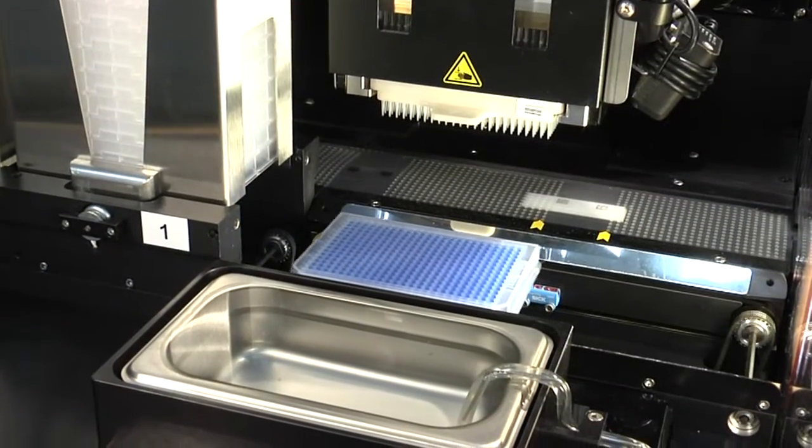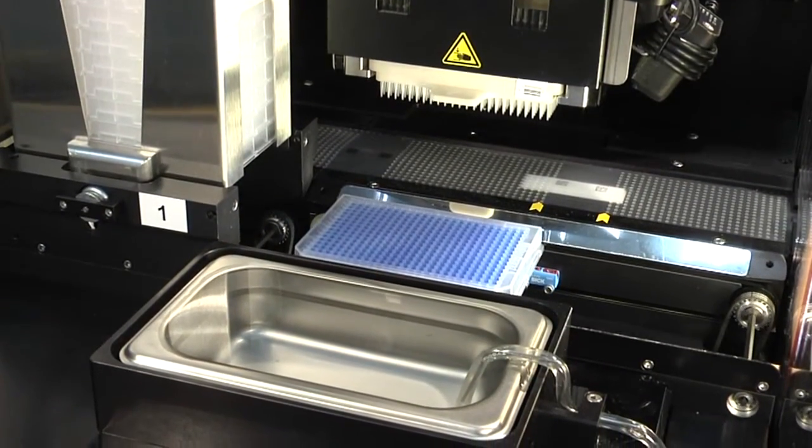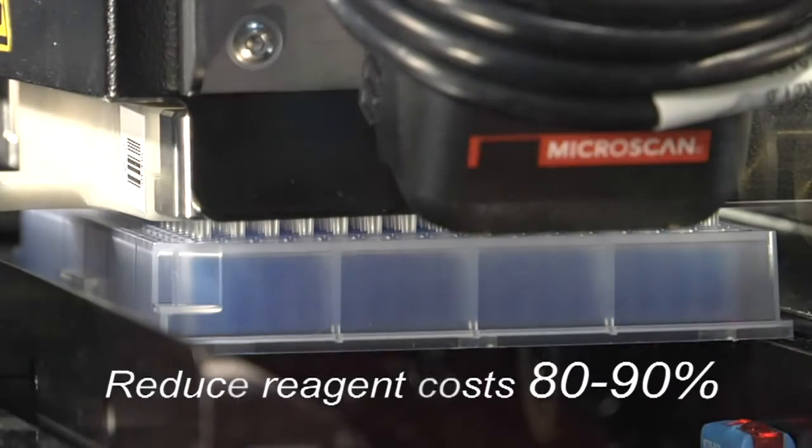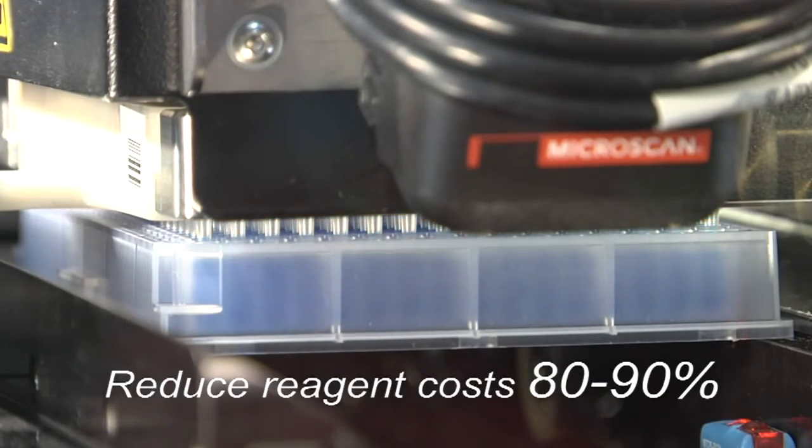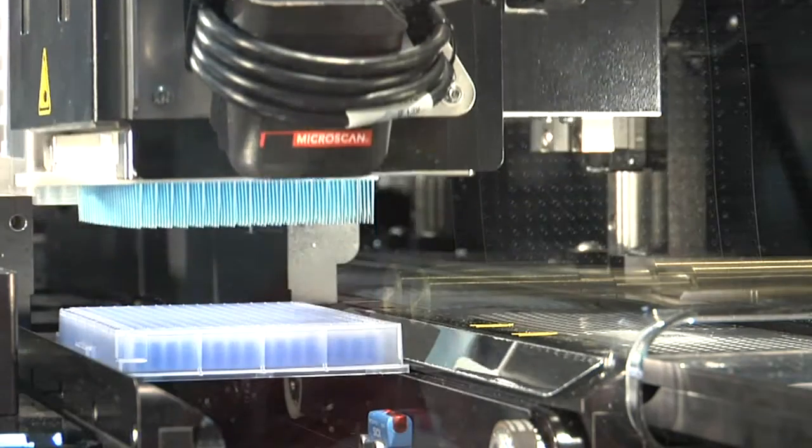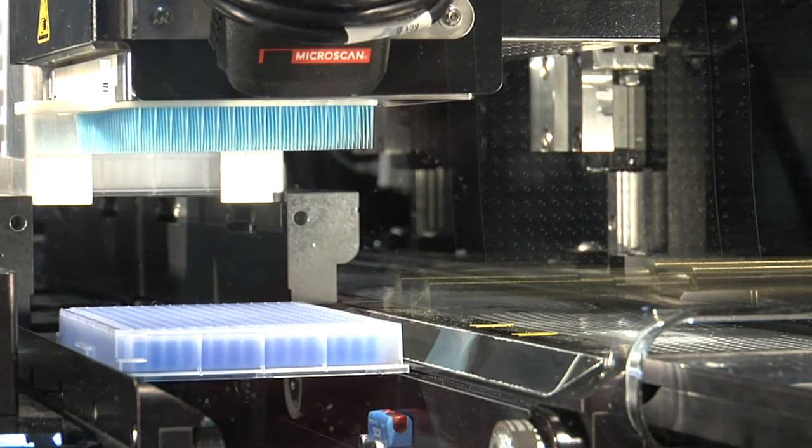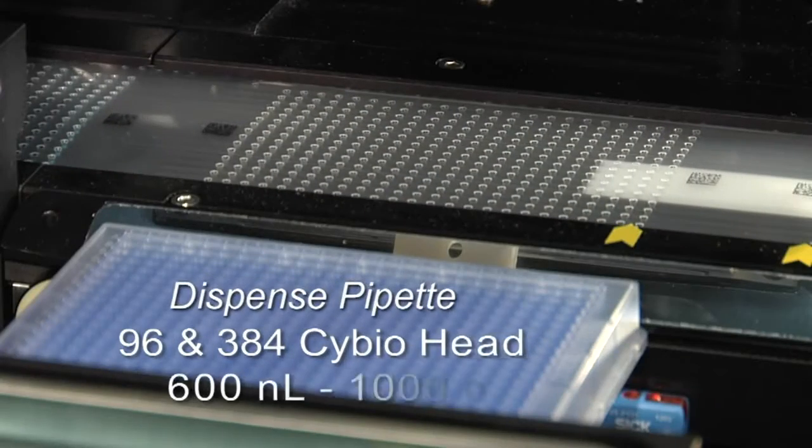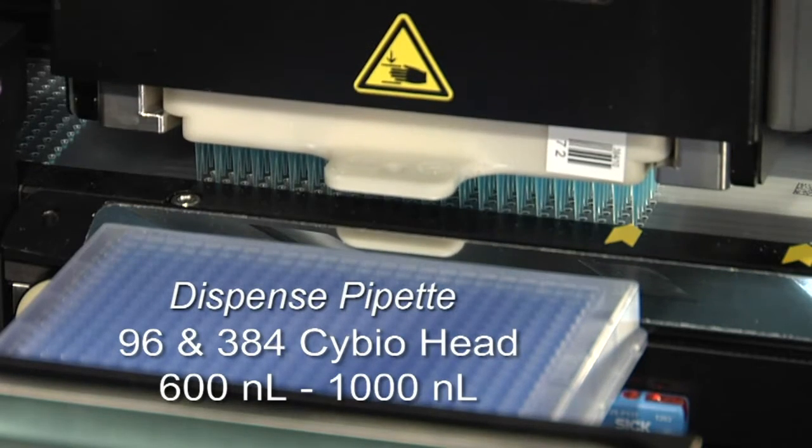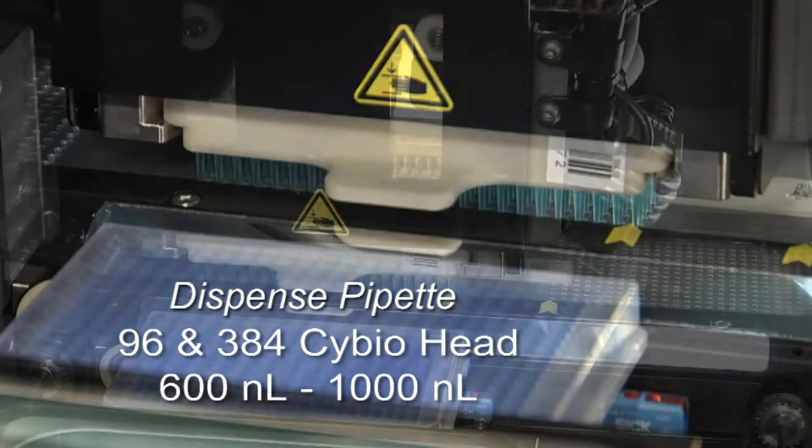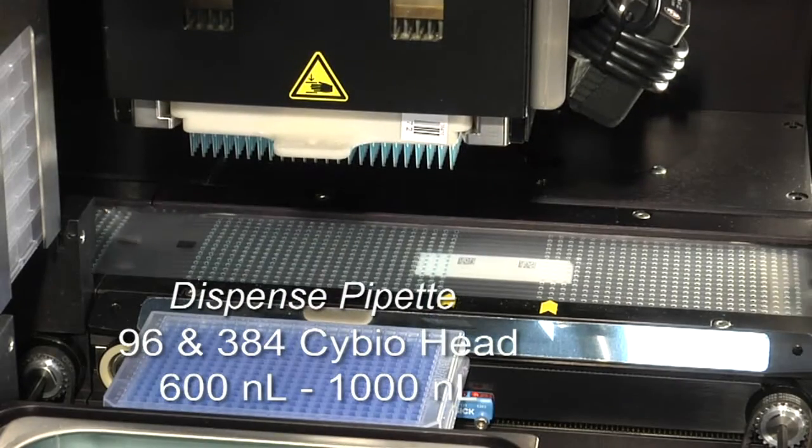The first step is to combine the reaction components in array tape. This step alone can reduce your reagent costs by 80-90% with miniaturized reaction volumes. Add the DNA sample in 384 wells at one time using CyBio contact dispense pipette. Volume ranges from 600 to 1000 nanoliters.